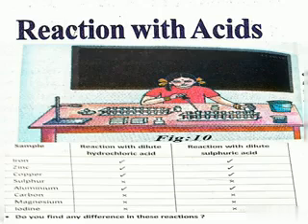Now bring a burning matchstick near the mouth of a test tube and observe what happens, and record your observation in table 8. Do you find any difference in these reactions? We find that some metals react with hydrochloric acid or sulfuric acid, liberating hydrogen, but non-metals do not react with acids. Repeat the same experiment with sulfuric acid and record your observation.